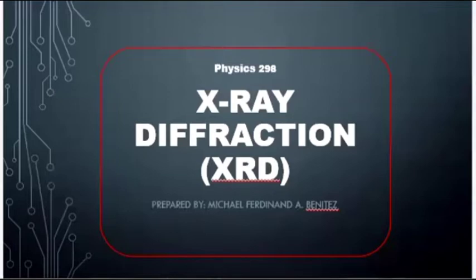So, good day everyone. I'm Michael Ferdinand Benitez, your today's presenter of X-ray diffraction. In this presentation, we're going to study some of the basic background of X-ray diffraction or XRD.